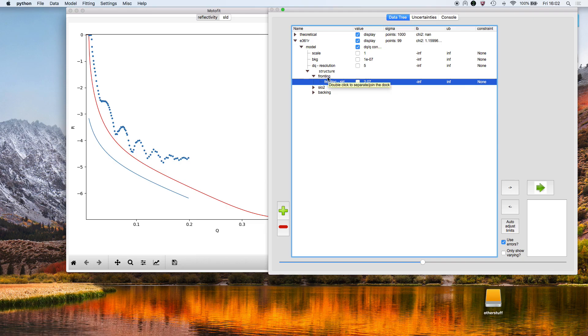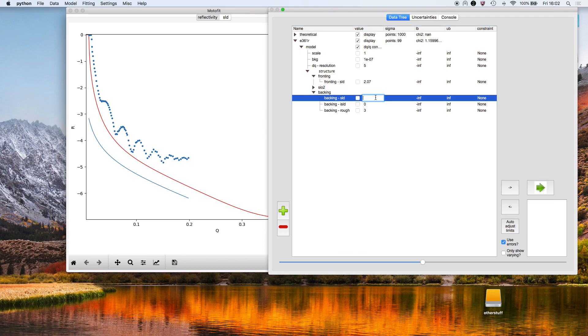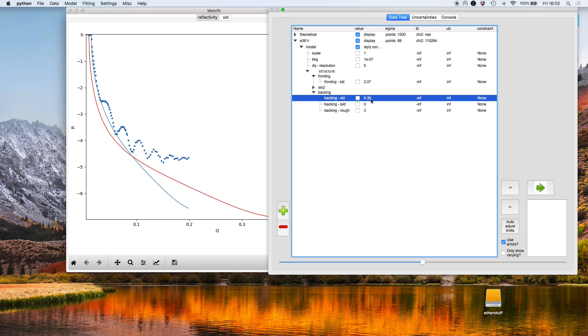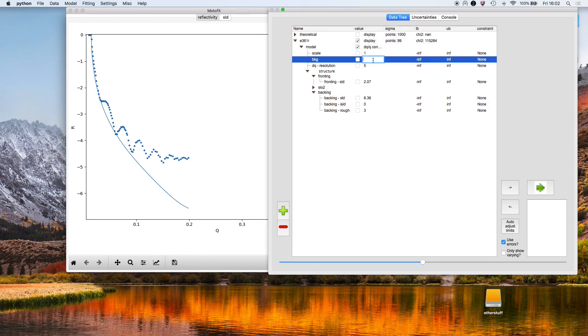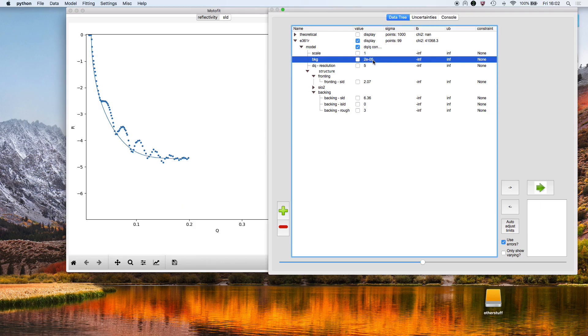I'm going to make the backing medium 6.36, i.e., D2O, and hide that theoretical model. We make the background 2 times 10 to the minus 5. The next thing that I'm going to do is add in another layer after the silicon dioxide.